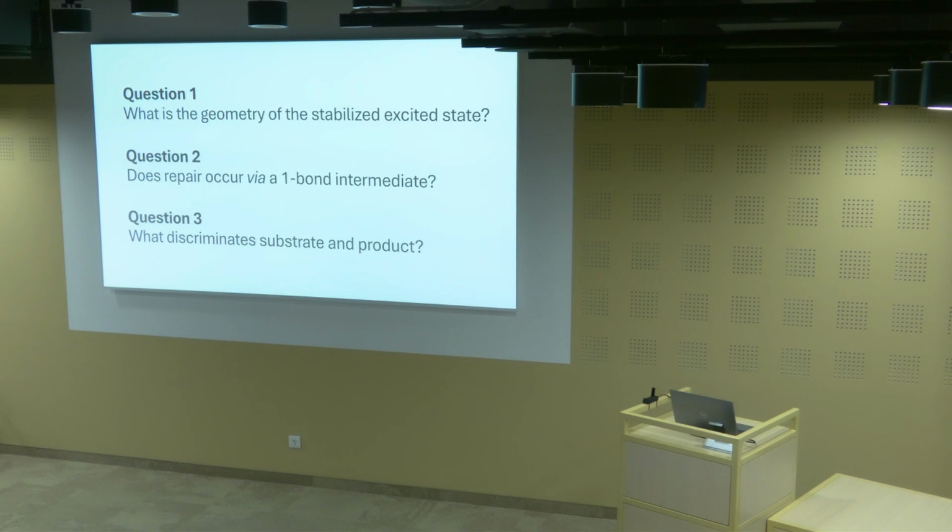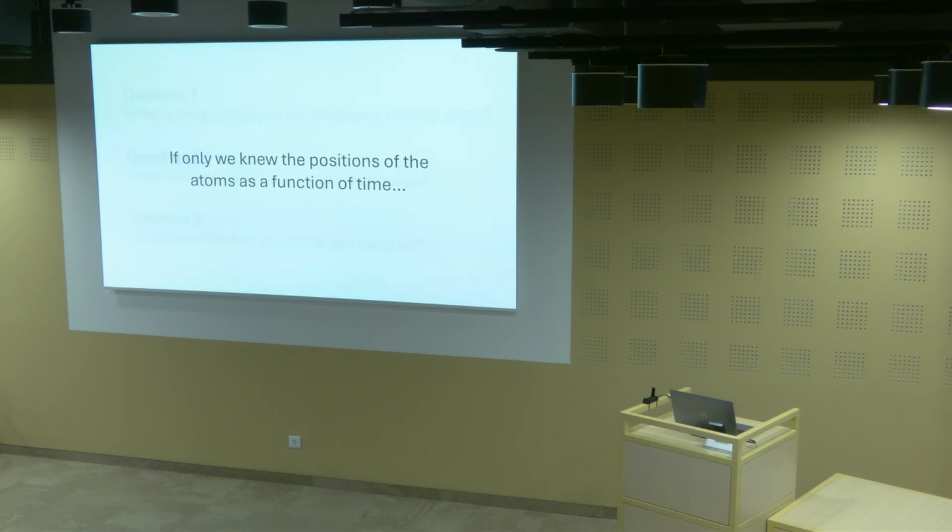So we had these three primary driving questions. I'm not going to say it's an exhaustive list, but they were the things that we were the most interested in going after if we knew the positions of the atoms as a function of time through a time-resolved crystallography experiment like we heard about this morning.